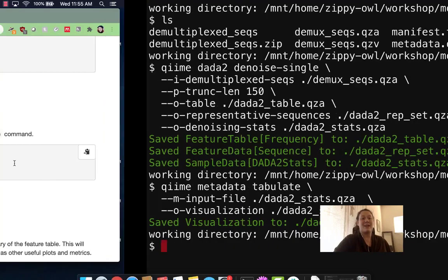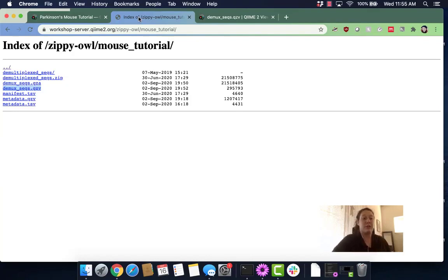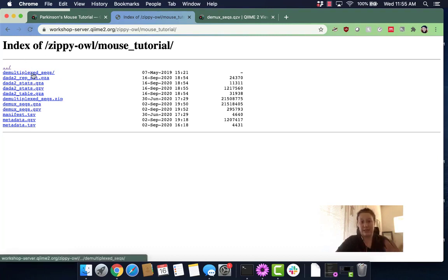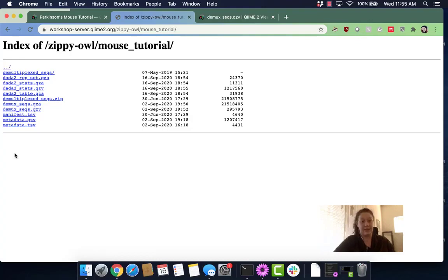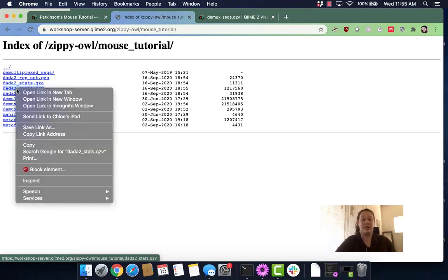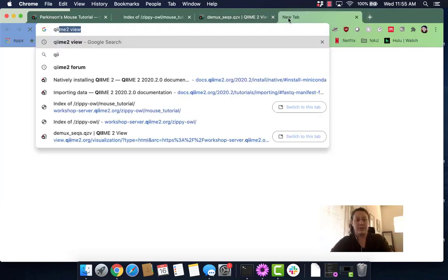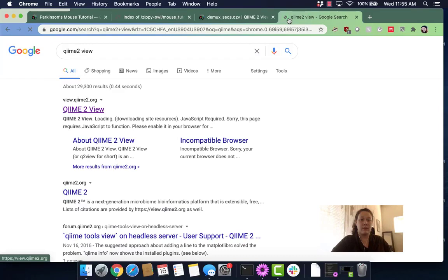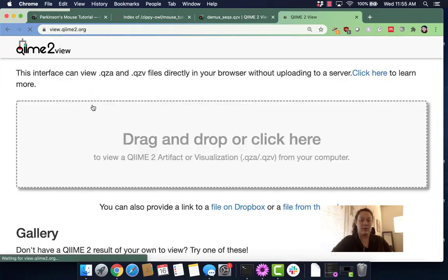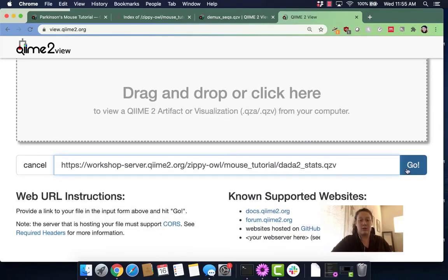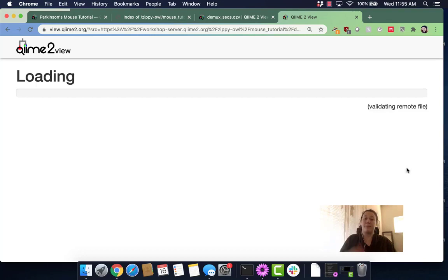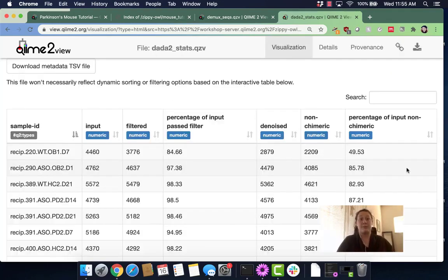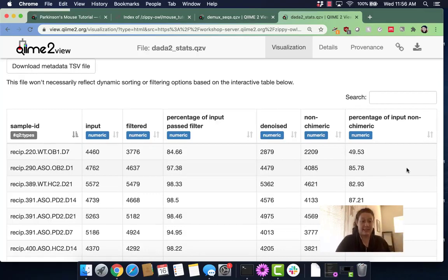So now let's head back to that visualization of the workshop server. Basically I'm going to refresh because this page doesn't auto-refresh when you get new sequences. Until I refresh we didn't have my new sequences that I had just created. So we are going to want this DADA2_stats.qzv. I'm going to copy this address link, I'm going to go to QIIME 2 view, and I'm going to get a file from the web. Then I'm going to paste that in there and it's going to create the visualization for me.